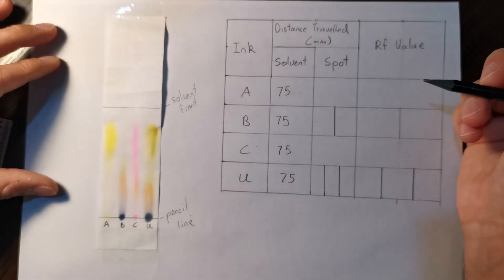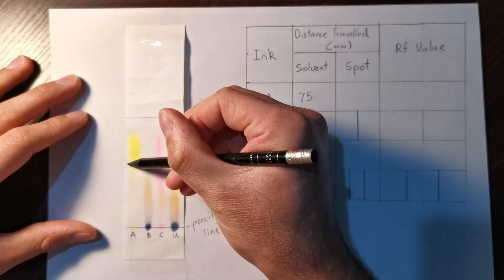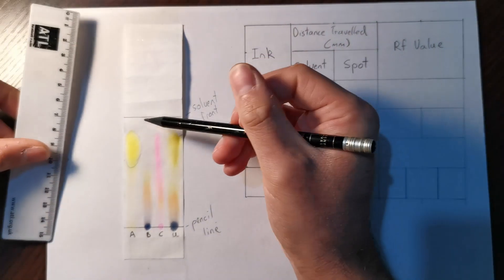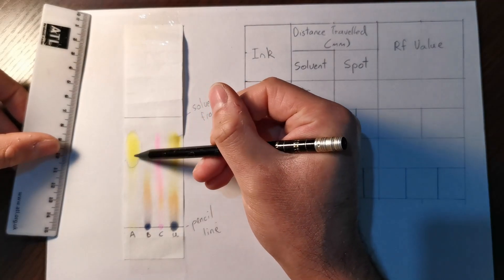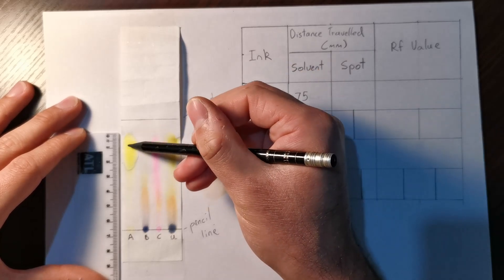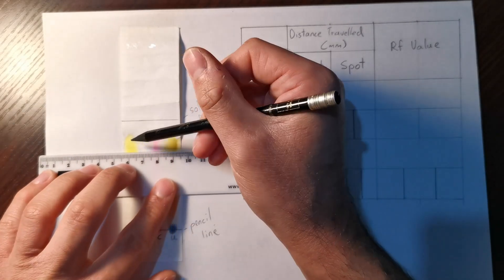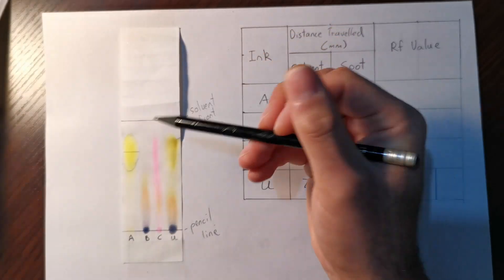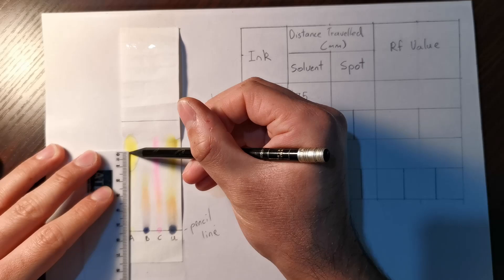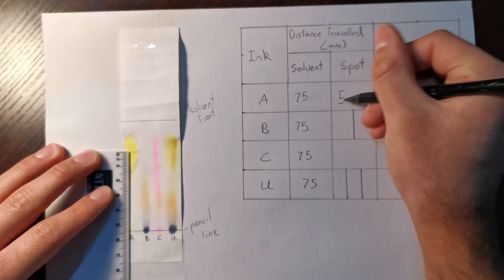Now measure the distance traveled by each spot. For A, there's only one spot — measure from the middle of the spot, not the top or bottom. The spot is about 2.5 centimeters long, so we measure from 1.25 centimeters in the middle. The distance from the middle of the yellow spot down to the pencil line is 54 millimeters, so we put 54 in the table.